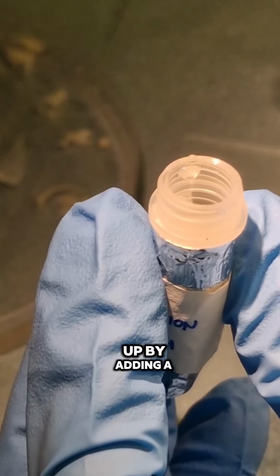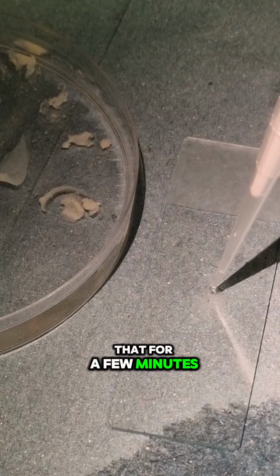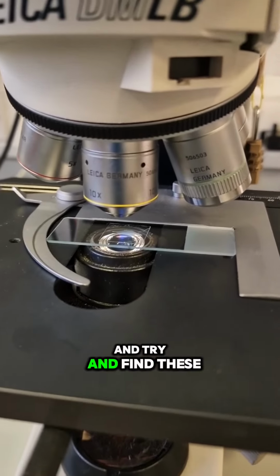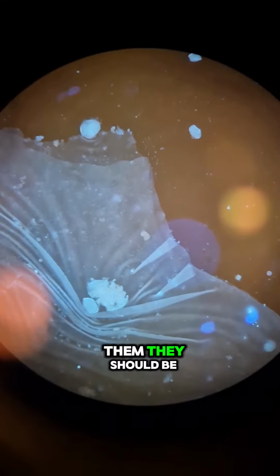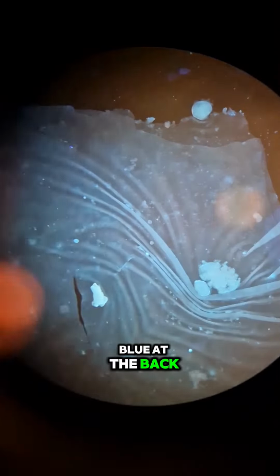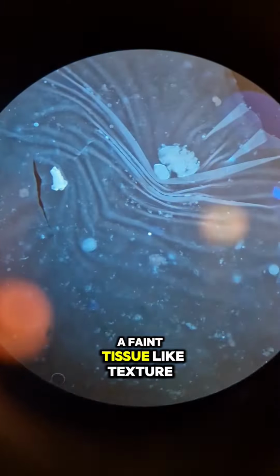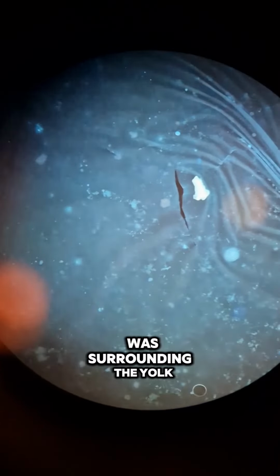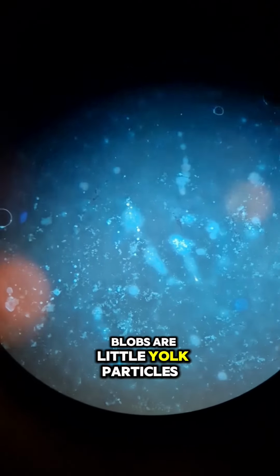And I follow this up by adding a special dye, and I will leave that for a few minutes to develop, and then we're going to put it underneath the microscope and try and find these baby tortoise cells. And if we find them, they should be seen as a bright blue. At the back, what seems like cloth or a faint tissue-like texture is this membrane that was surrounding the yolk, and these other little blobs are little yolk particles.